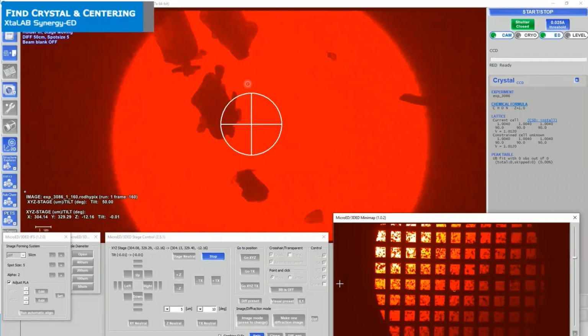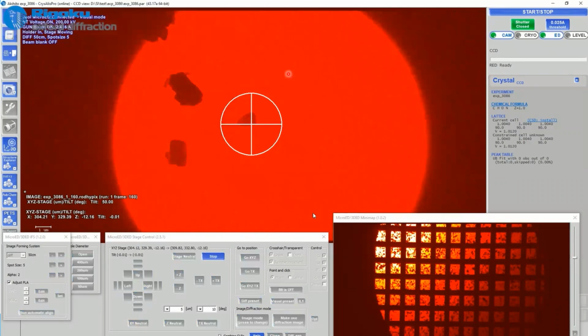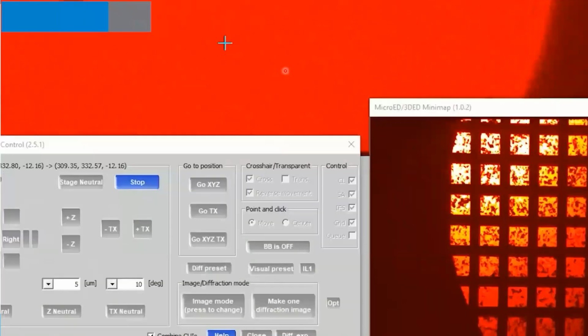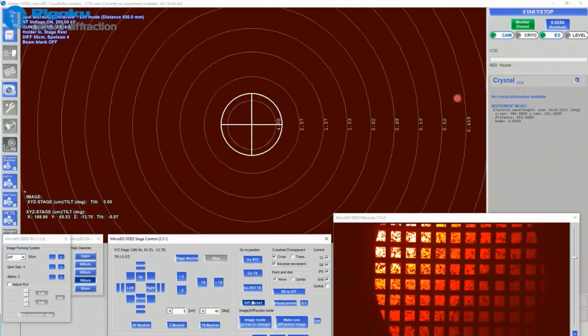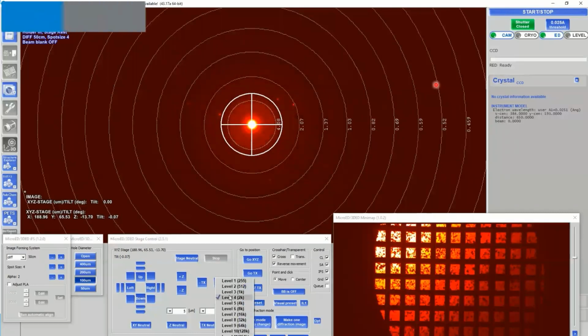And also in this window, you can navigate using a point-and-click interface, and you'll see that now. So the way to move the stage of this crystal is just by simply clicking it. And the next step is to check if that crystal diffracts at all. And it's only a push of one button to switch this whole electron beam line from this visual screening mode into diffraction mode.